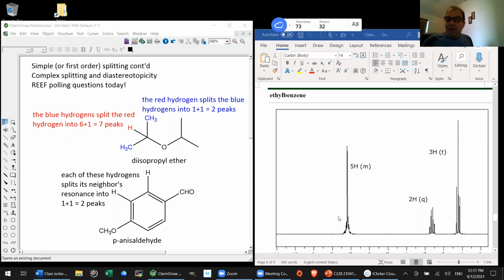So I would say that's one thing to be on your guard for, is these monosubstituted benzenes, especially when the substituent group on the benzene is an alkyl group or something similar. In cases like that, even though theoretically the aromatic hydrogens aren't all the same, in practice they're so similar that they just fall on top of one another.